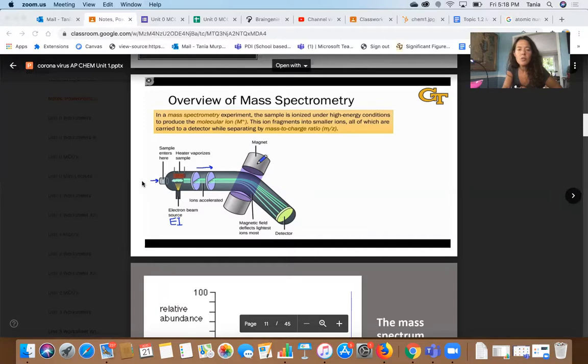So you put your sample in here. Actually, they're not always pure, that's not true. The particles, and for us, it's going to consist of atoms, get ionized, right? Ions are accelerated. Here we have a positive.